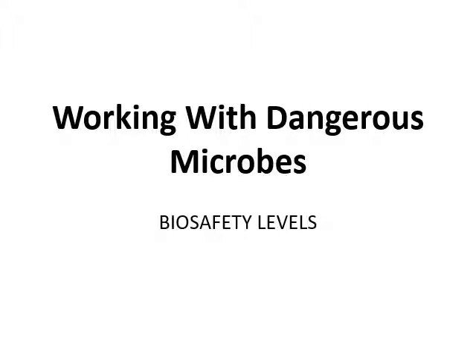Right? So how do you deal with hazardous microbes in the laboratory? Well, the microbiologists have developed things that are called biosafety levels. We have biosafety level 1, 2, 3, and 4. And these are certain precautions and certain types of personal protective equipment, or PPE, that you have to use if you want to protect yourself while working inside a laboratory with certain types of microbes. So let's go through the different biosafety levels. You are responsible for knowing this for the course as well.